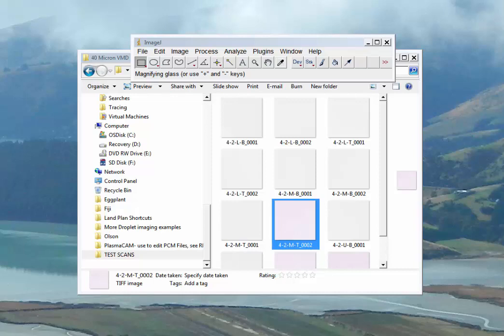By defining that range so that you can exclude all of the other colors that don't have anything to do with your spray, you can get a very accurate idea of your percent cover, number of hits, and other things like that.